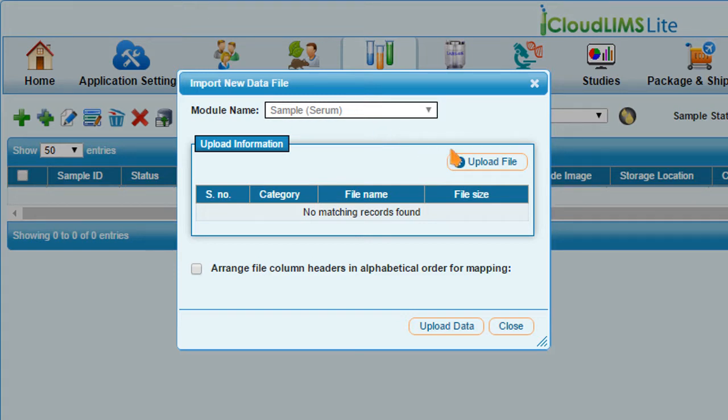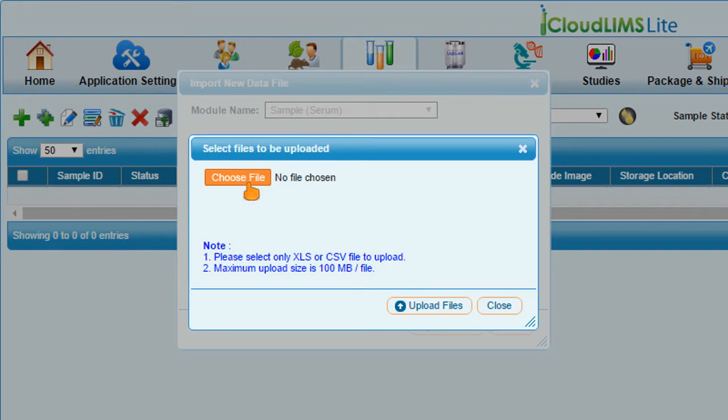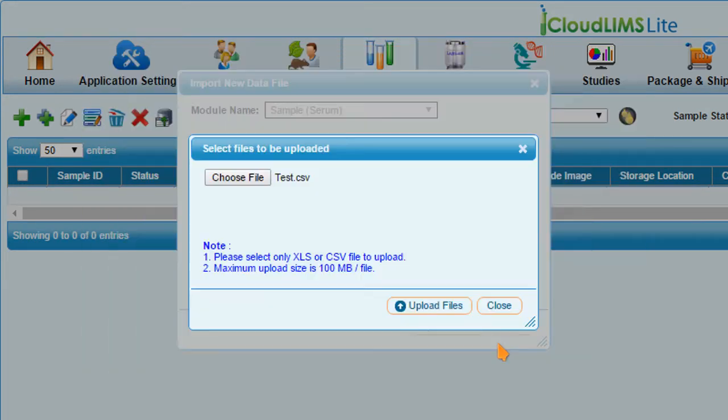click the Upload File button to browse for the .csv or .xls file that contains the data to be imported. Click Choose File, select the file, and then Upload Files.